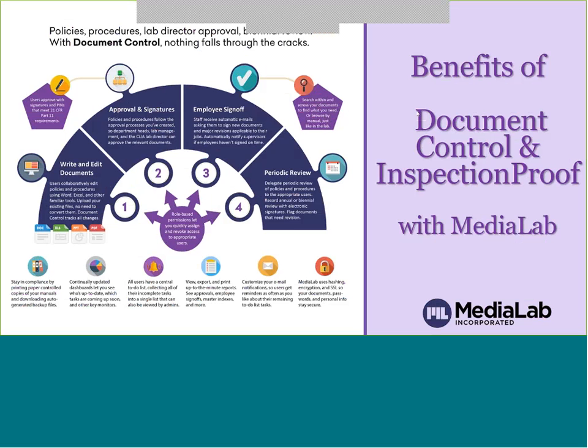I worked as a med tech for a number of years and then as a lab administrator in the Philadelphia area. And our hospital actually utilized both of these MediaLab systems along with a few others. And we're really able to achieve success with our document management and inspection preparation processes. So I'm happy to tell you a little bit about that experience and show you some of my favorite features in the system.